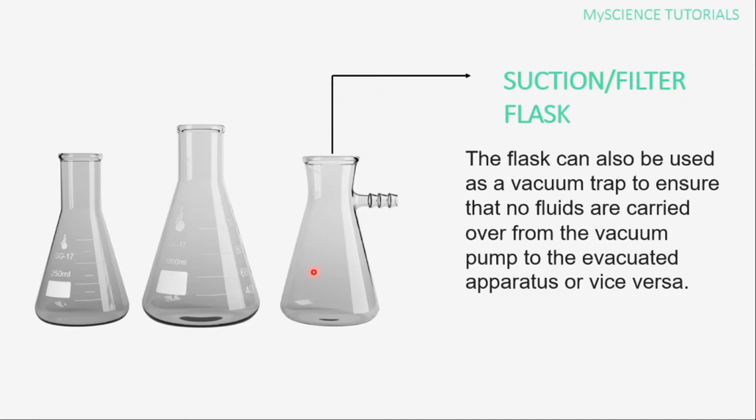As the liquid drops over here, the vacuum pump is sucking the air out of the flask, thereby making your solution, the filtrate and the solution, come out at a faster rate. So the water will be prevented from going to the vacuum, and in the same way from the vacuum source into your flask.